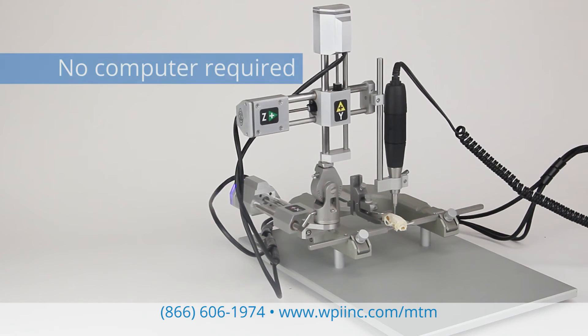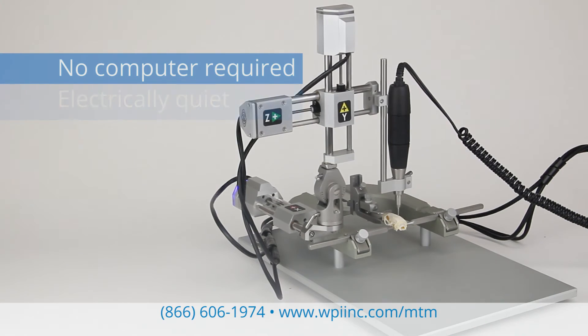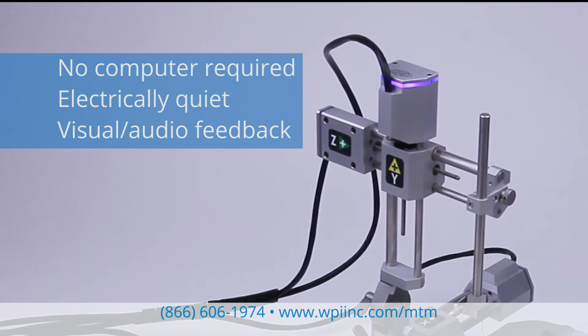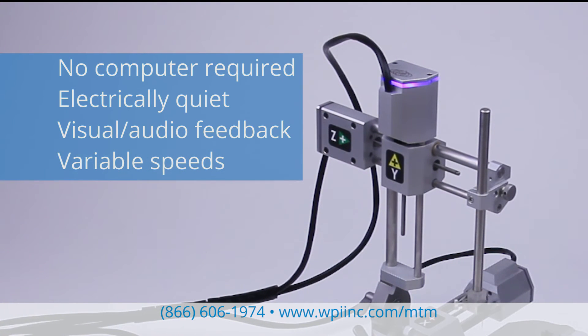No computer is required. Additionally, the MTM is electrically quiet. It has visual and audio indicators with each axis and variable speeds.